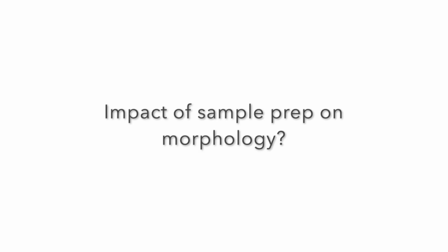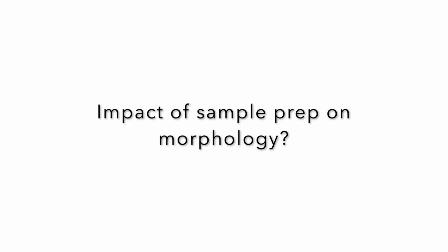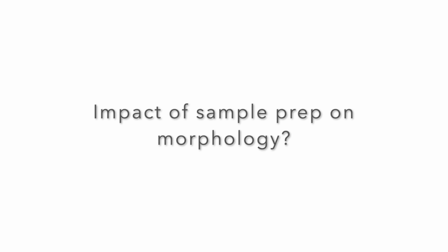And I think one question we were sort of asking ourselves in the beginning, okay, do we do a fixation of cells after doing the thawing and trying to get rid of the debris? Do we fix the cells, or should we just analyze them straight? So we were thinking, actually, we wanted to do some follow-up by flow analysis. So we decided to go ahead and fix the cells. But it was really nice to see the consistency among the different healthy donor samples, but then also with the AML cells. So it's good to have also these replicates. Our replicates were mainly different disease samples and different healthy donor samples, but the results were all consistent.